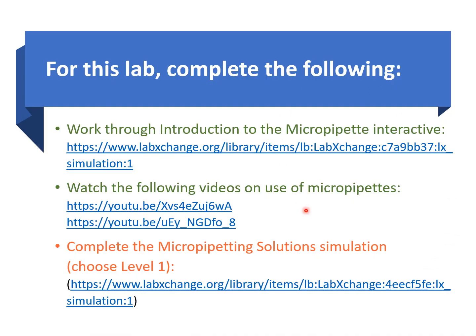For this lab, there's also this interactive micropipette website that I highly recommend that you guys check out. There are also a few videos that will help you see how a micropipette is used in a microbiology setting. And then there's also this other simulation. Go ahead and try it out. Those are all going to help you see and try out how a micropipette is usually used.